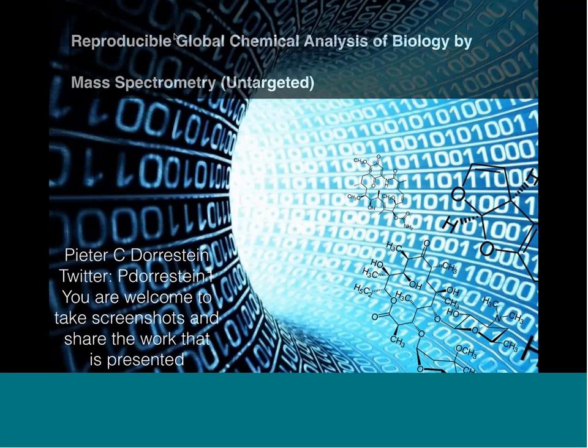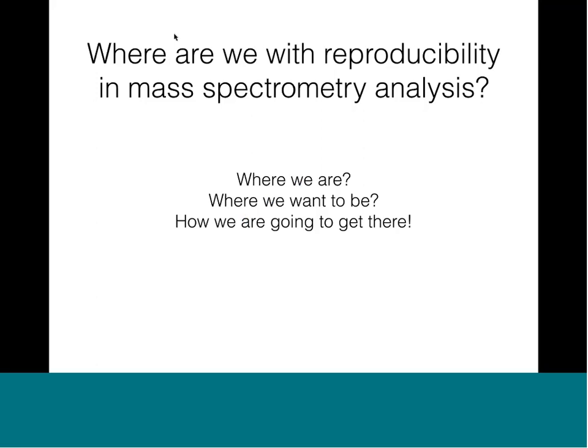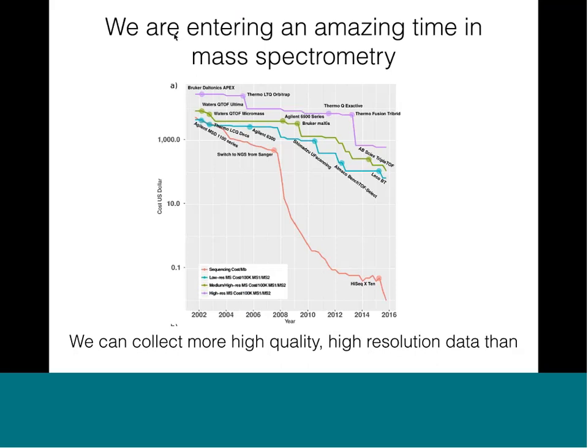So what I'm going to try to do today is really highlight where we are with reproducibility in mass spectrometry analysis, where we want to be, and maybe think about how we might be able to get there.